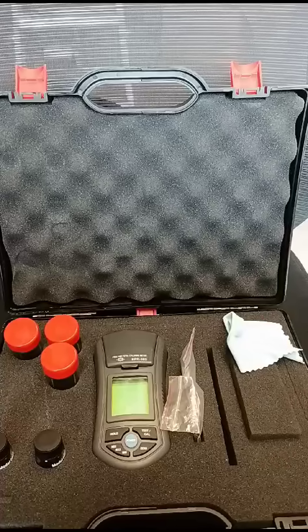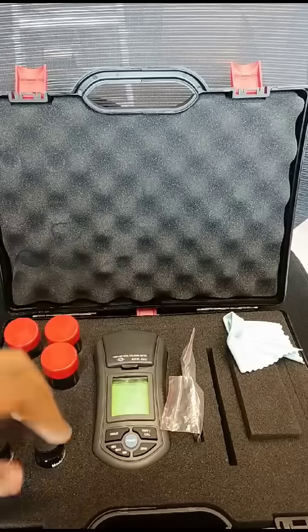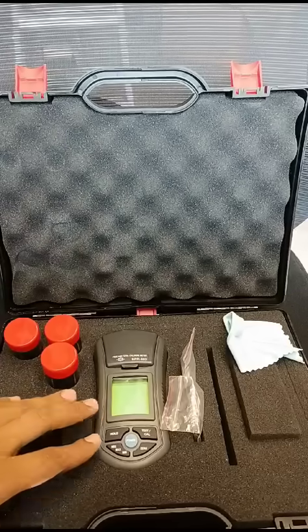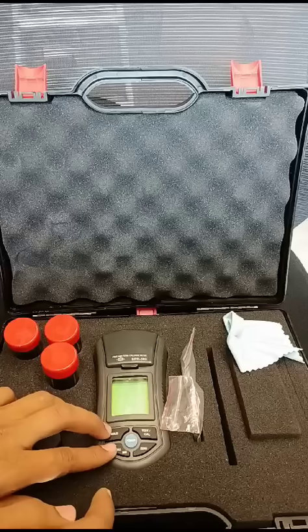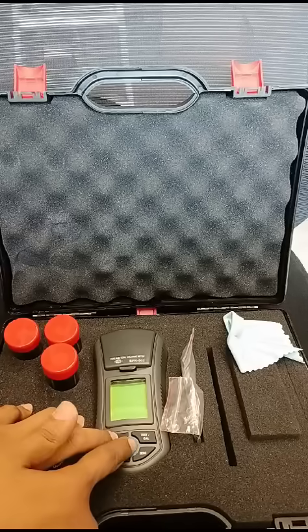Hello everyone. Now we want to know how to use the chlorine meter. Firstly, you should press and hold the record button, and then press the power button.